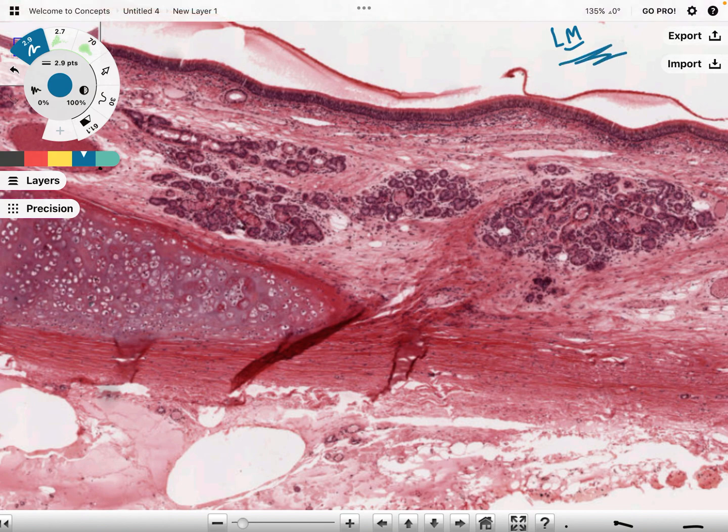So here's the lumen here in this wonderful space. Another way to identify where the lumen is is to look for the epithelial layer. The epithelial layer tends to be thin in most of these structures, and it tends to also stain really dark. So this, of course, will be our epithelial layer here for our trachea. This is made up of the pseudostratified ciliated columnar cells, and there are also some goblet cells embedded in this layer producing mucus. When you include those two together, you get the mucociliary escalator, that thing that is essentially trapping these particles and moving them so that they can be swallowed and destroyed or coughed out.